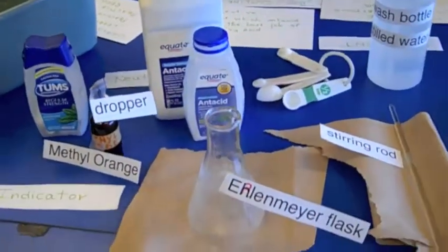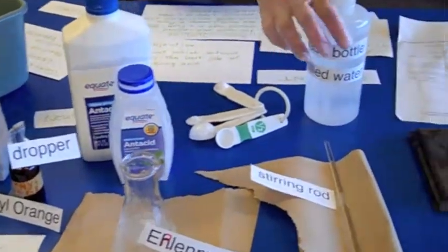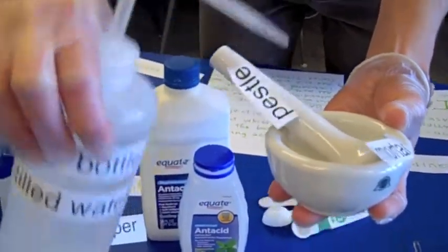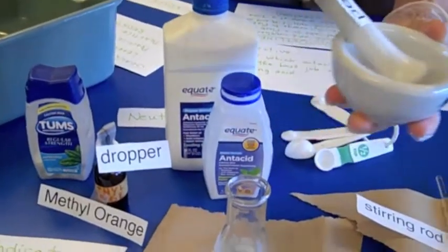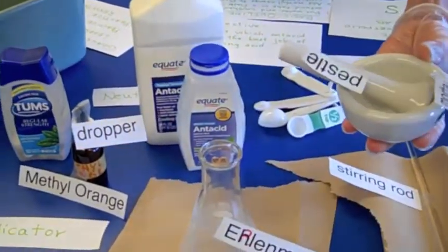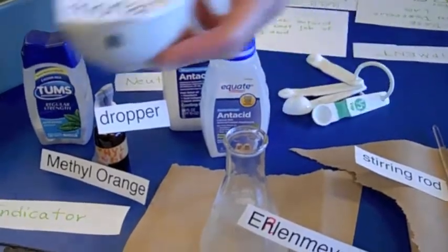And this is after you've, first you dump in the powder, then you are going to rinse down the mortar and pestle to get any remaining grains of Tums off of there. You do that 3 times? We do that 3 times. Rinse, pour. Rinse, pour. One more. Rinse and pour. Hopefully that will get everything off of your mortar and pestle.